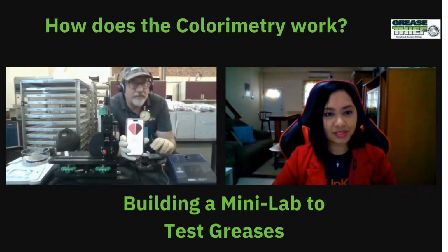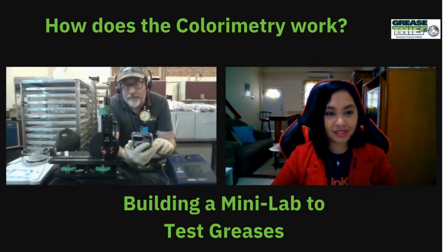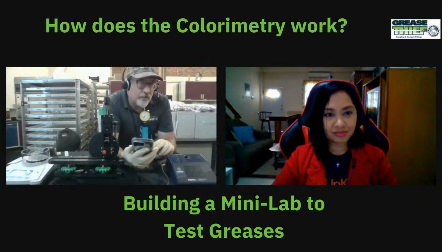And remember when we do delta E for the MPC testing, it's relative to the white patch, right? So we're saying how dark it's gotten. Here, it's a delta between the new grease that's in our library and this grease, which is coming from a machine that's using that. So interesting. Delta 28.7, that's more than just a little bit of a color change that we expect. That's a lot. It's quite a bit. We might be content with it changing mostly in the L star values and a delta E of, let's say, 10 to 15, something like that, but you're getting up close to 30 here.